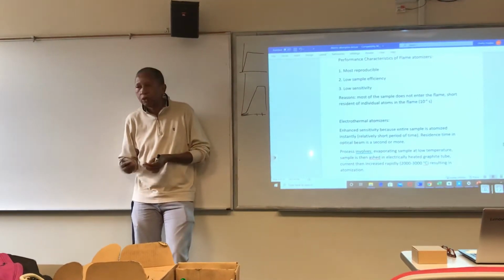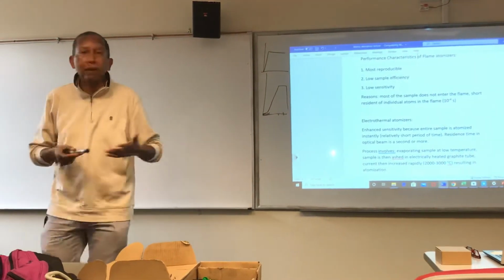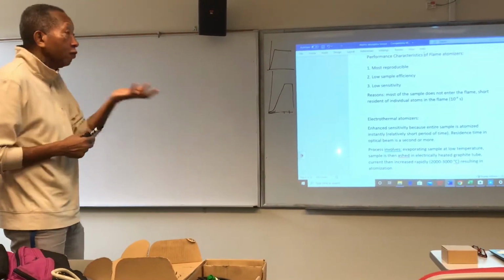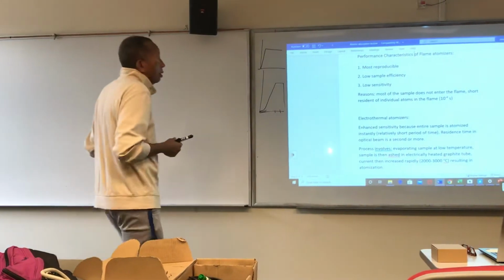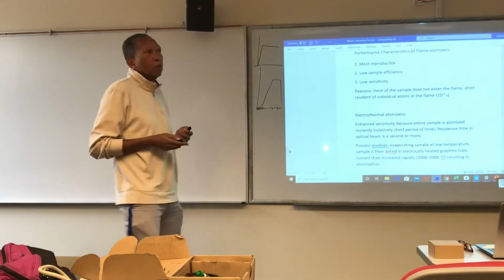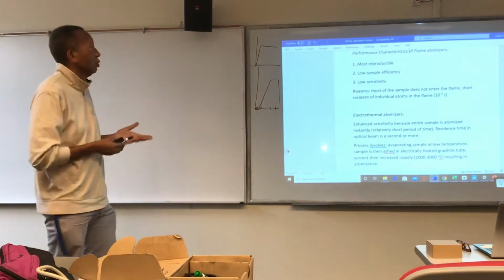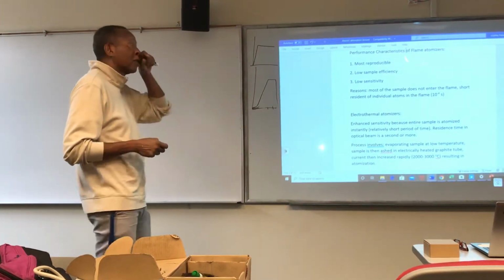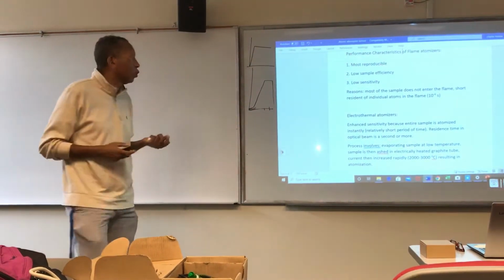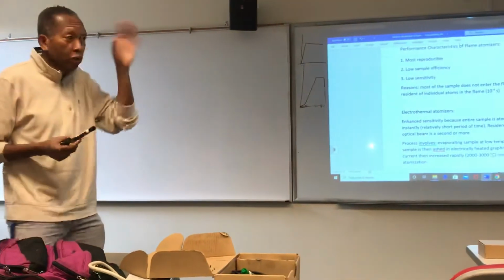You say you want a cell phone with a really good camera, right? So you can take pictures in low light and high light, so then you have a good resolution, it doesn't come out blurry. So you've listed performance characteristics there, right? So the same thing, what are the criteria we would use to compare different atomization techniques, right? So the performance characteristics for flame is the most reproducible, right? The disadvantage is that it has low sample efficiency. Remember when we aspirated it up, the baffles reject most of the sample.